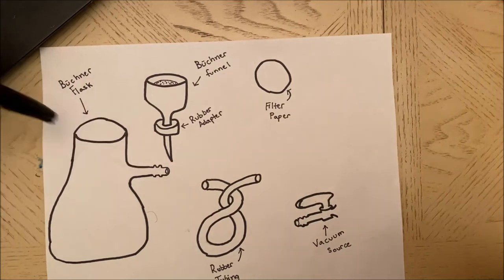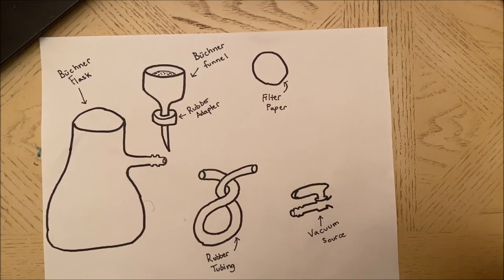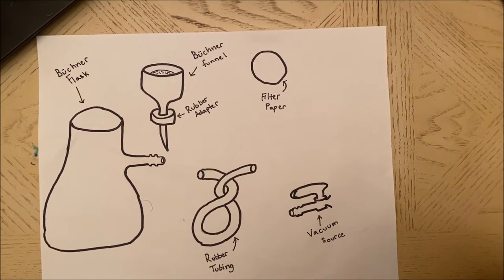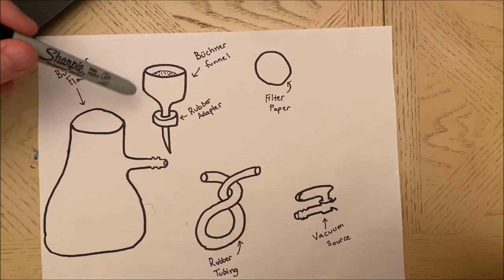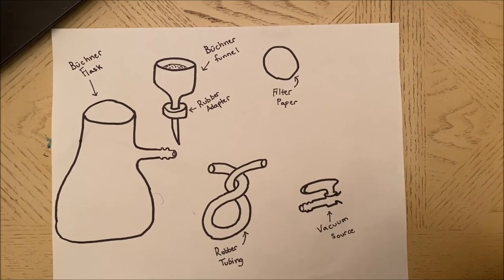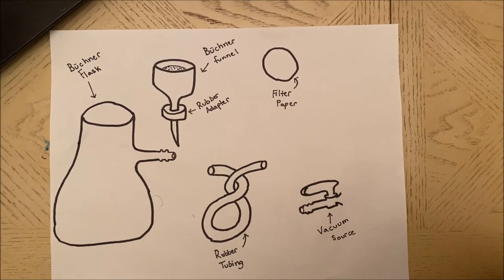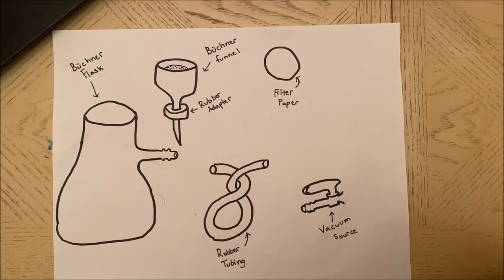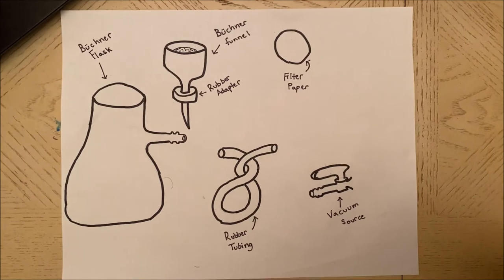A couple things to note: vacuum filtration is faster than gravity filtration because the solution is being forced through the filter paper by an application of reduced pressure. This is in contrast to gravity filtration where only gravity would be acting on it.